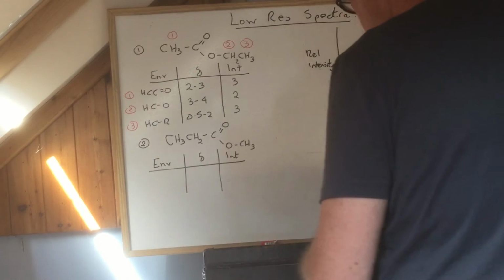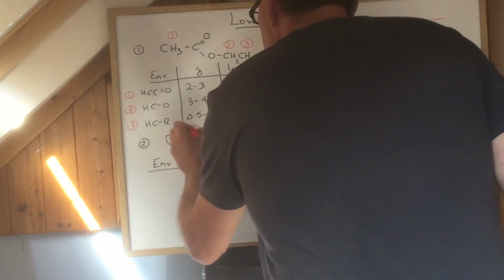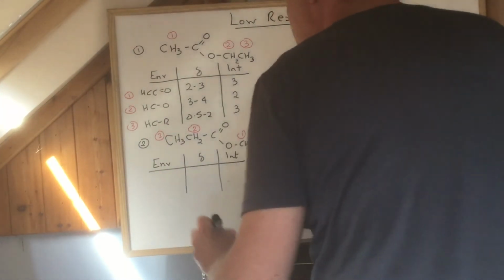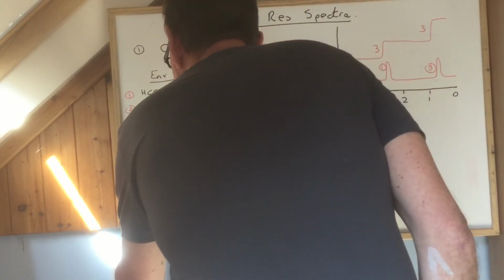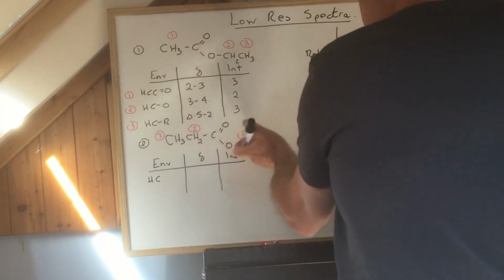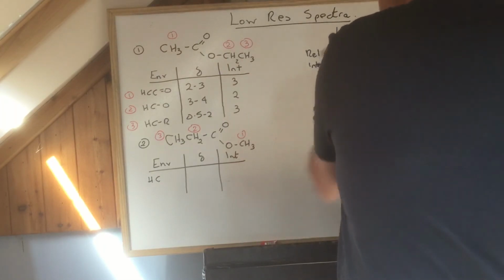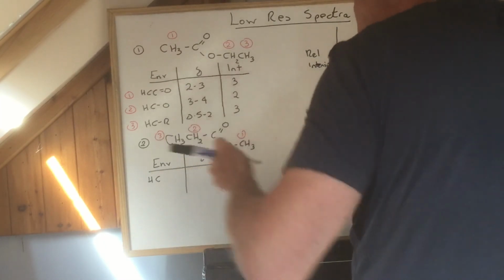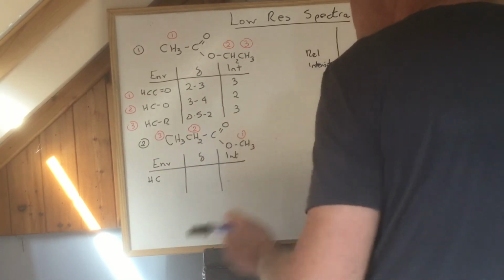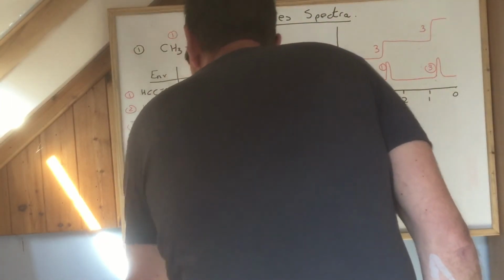Okay. Right. This one underneath, same deal really. I don't know which way you want to go. Seem to have gone this way. 1, 2, 3 different proton environments, end of. So let's start on this one. It's always like, that's hard because you want to go, I don't know, right to left or left to right, but where the peaks actually appear jumbles that up. So you're always having to think, constantly check, where am I at, which am I looking at, which part of the molecule am I looking at. There's a lot of things you're thinking about all the time. So we'll start with that one.